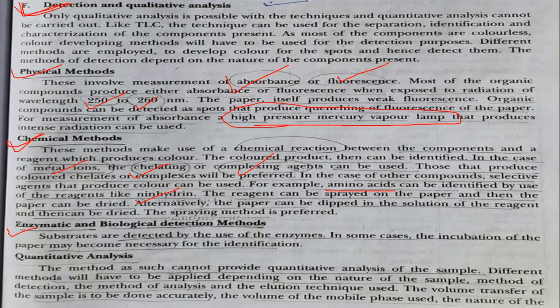Okay, so enzymatic and biological detection method. Substrates are detected by the use of enzymes. In some cases, the incubation of the paper may become necessary for the identification purpose.